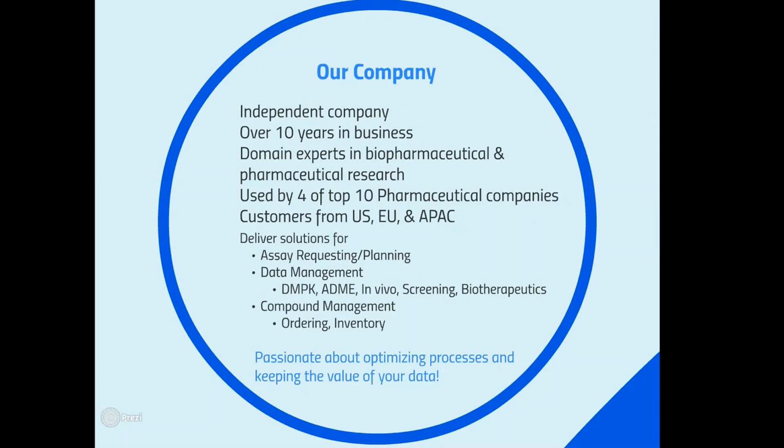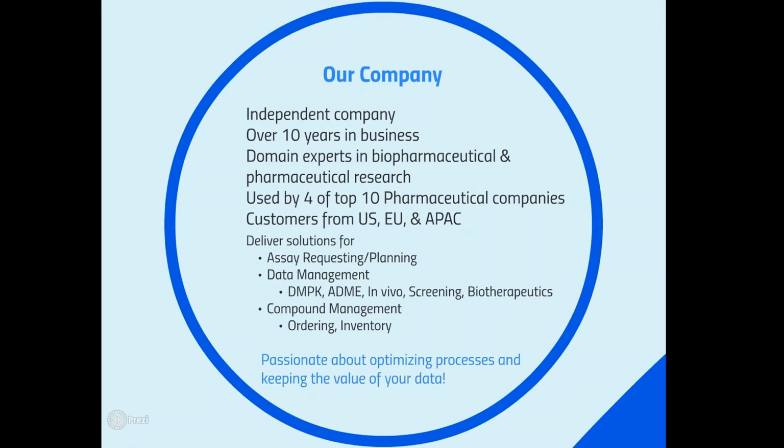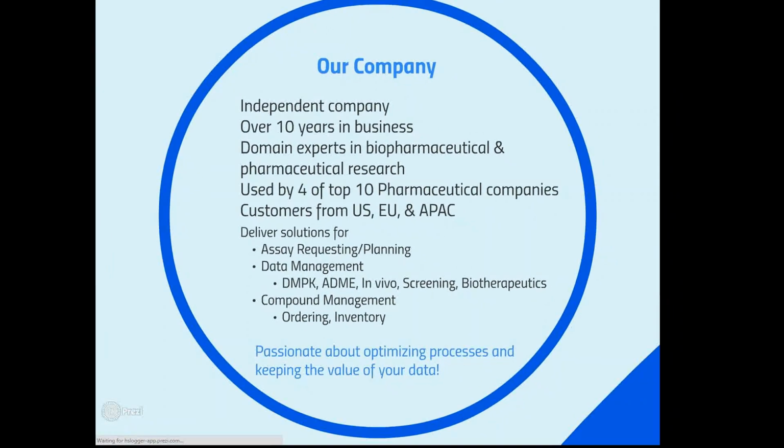We deliver solutions across a number of different areas, as Doug mentioned during the introduction, covering everything from global assay requesting and planning solutions to data management in areas like DMPK, ADME, in vivo pharmacology and other in vivo areas, screening and biotherapeutics. We also provide modules for compound management, supporting ordering and delivering of inventory. So really covering the full workflow for a biologist from demand generation all the way through to inventory, supply, and testing. If there's one thing we're passionate about, it's helping people to optimize their processes and also keep the value and structure of their data. And that's really what drives us.